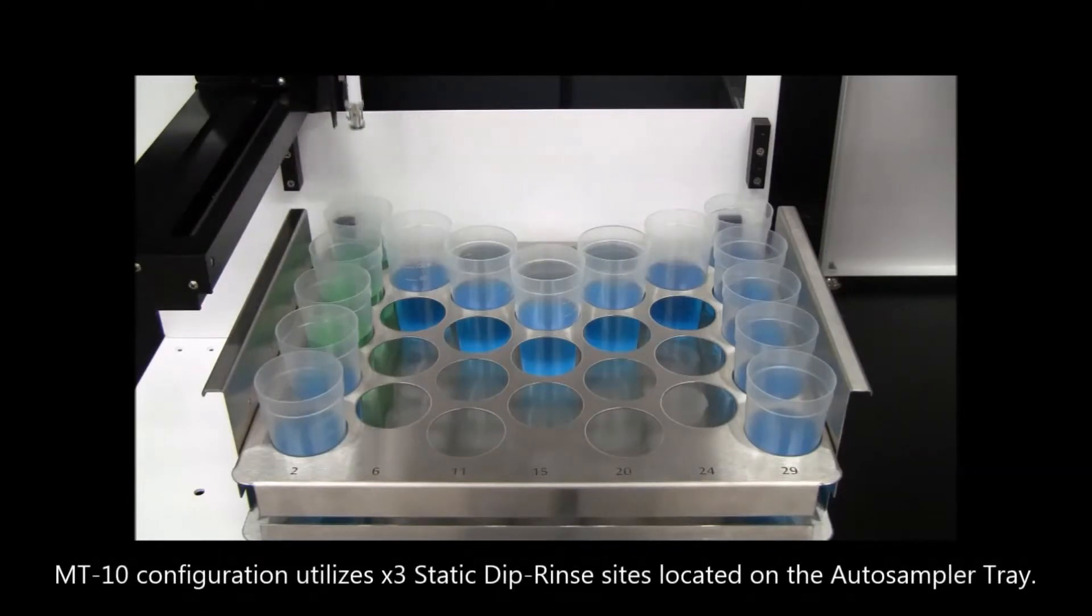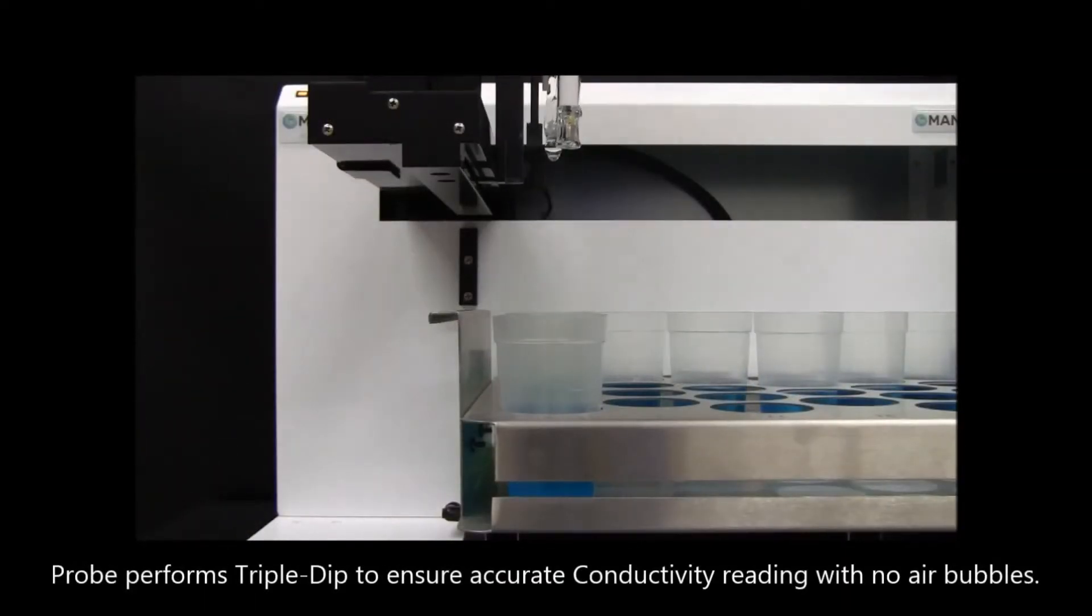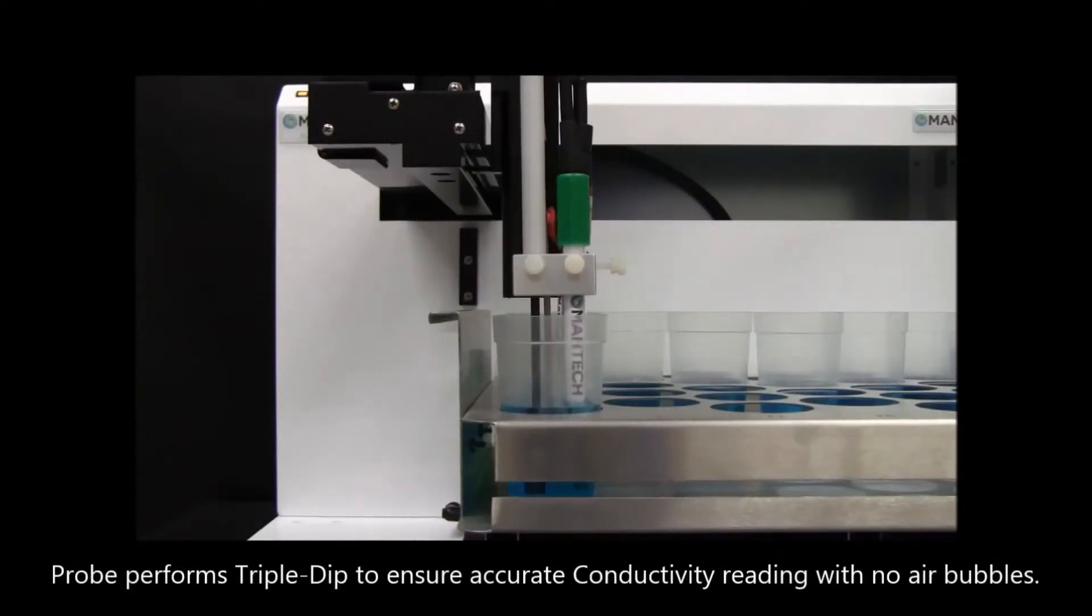The MT-10 configuration utilizes three static dip rinse sites located in the sampler tray. The probe then performs a triple dip to ensure an accurate conductivity reading with no air bubbles.